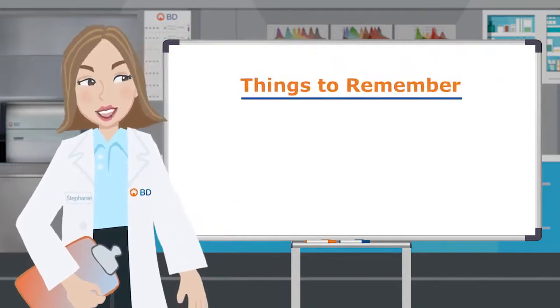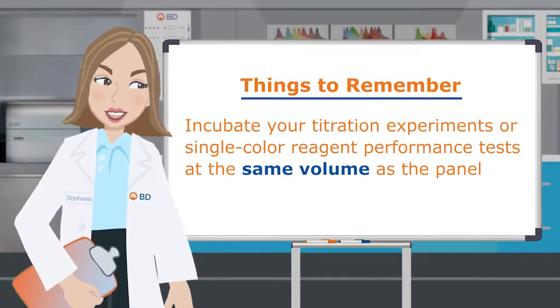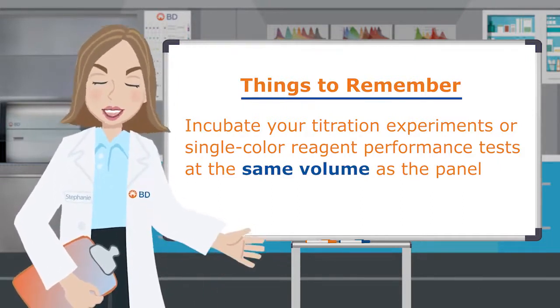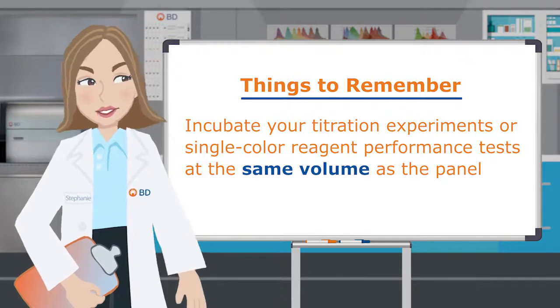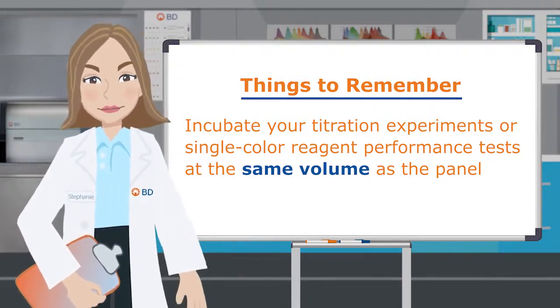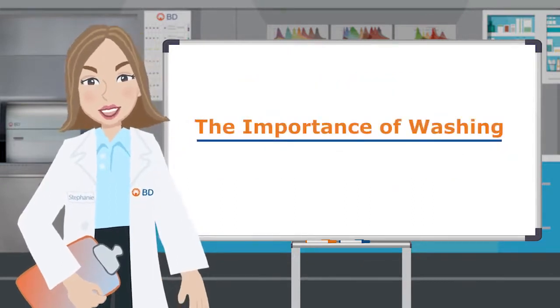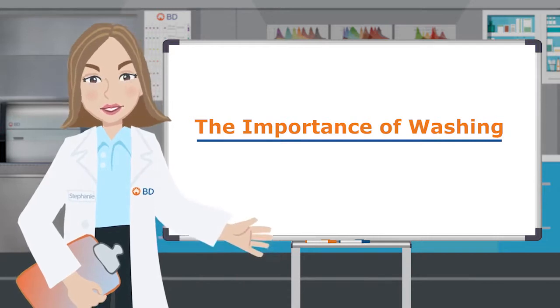Due to this effect, it's best to incubate your titration experiments or single color reagent performance tests at the same volume as the panel. This way, you ensure that the resolution of the panel will be similar and there shouldn't be any unpleasant surprises. An important step in either mouse or human staining protocols is the need for washing.